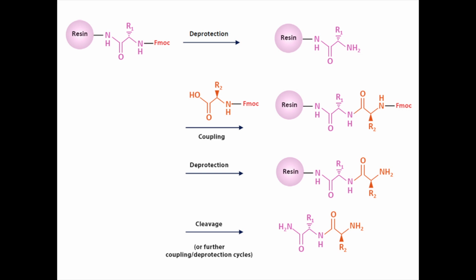When you're ready to take it off, you then add the next amino acid. They bind. You're going to continue that cycle for a while, because that next amino acid is going to have that FMOC protecting group, and some of the side chains that amino acids have are reactive, so they have other special protecting groups as well.